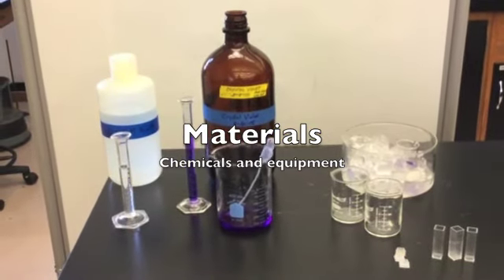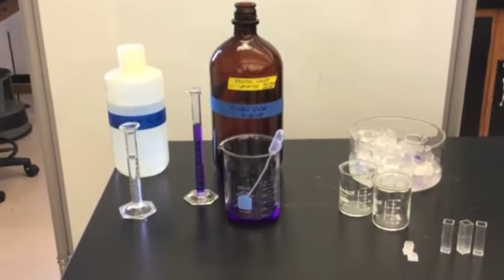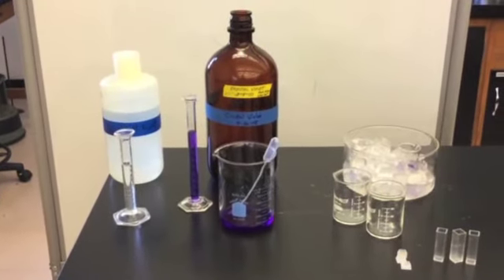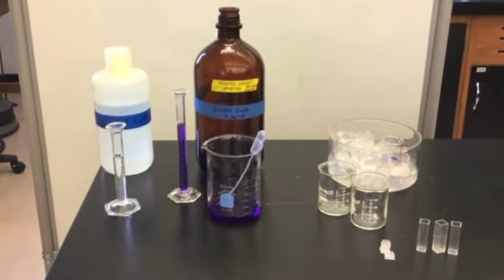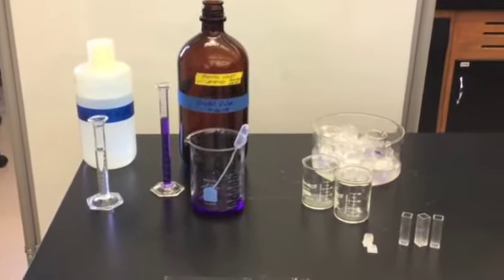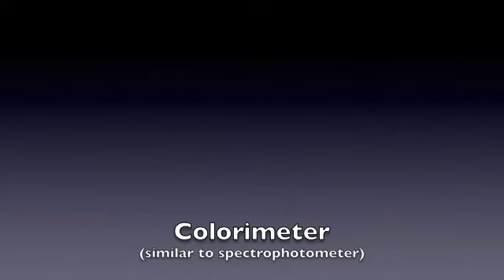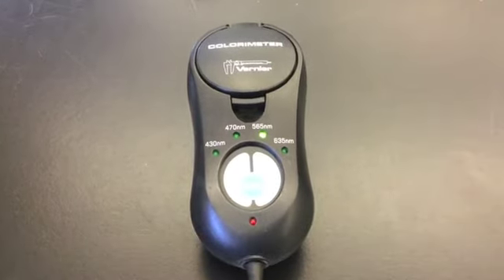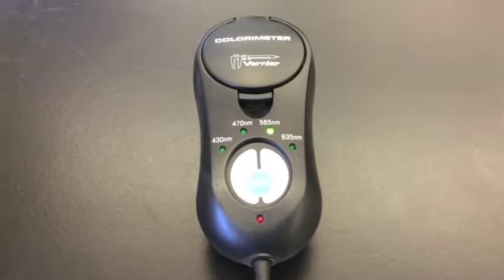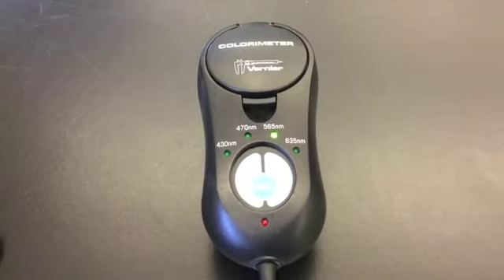For this lab, you will be using 0.02 molar sodium hydroxide, a prepared crystal violet solution, 10 milliliter graduated cylinders, beakers, an ice bath, and cuvettes. We will be using Logger Pro, and you will be using the colorimeter that goes with Logger Pro. The setting on the colorimeter should be 565 nanometers.